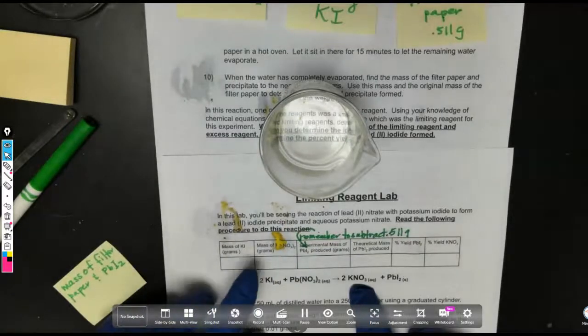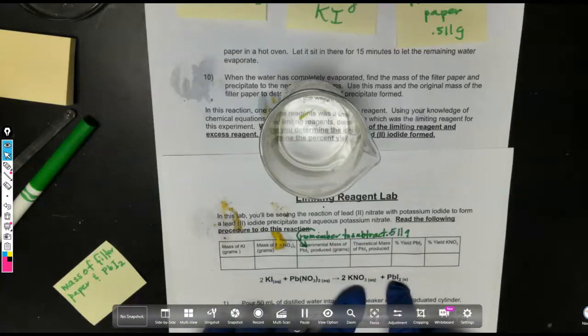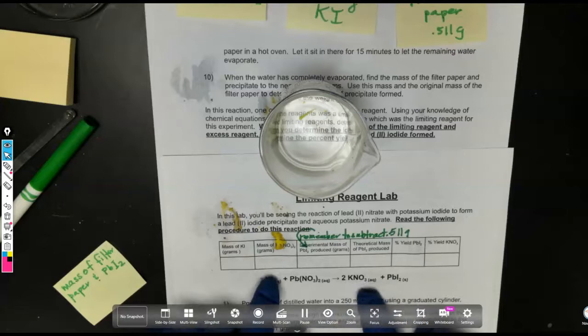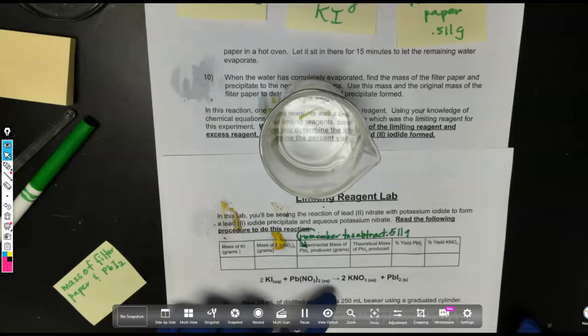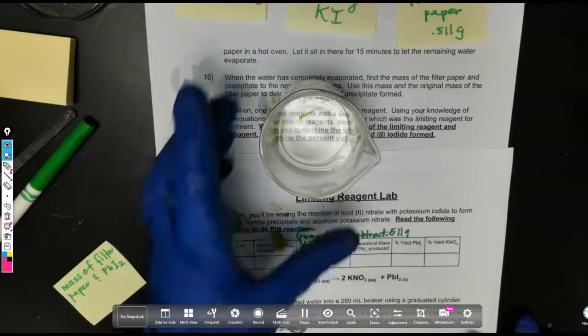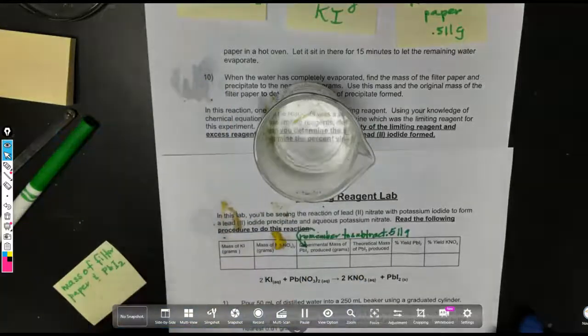So if everything is 100% perfect, then we have KNO3 aqueous left in this beaker. But if it is not, then we have some mixture of the excess reactant and KNO3 both dissolved, making an aqueous solution of both of them. And what we have to figure out is how much excess reactant is left over.